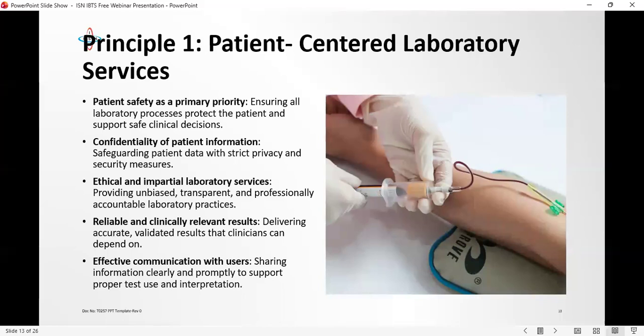what medication they are going to give to the patient, who gets what dose. Imagine a microbiology where you just give a result and you just say, yes, all the antibiotics are sensitive. You did not do proper quality control to find out what organism. You just said mixed growth. All the antibiotics are sensitive. The doctor will come back to you and say, I don't understand what you did. You need to tell me it's 1, 2, 3 organism, whether it is Staph aureus, whether it is E. coli, whether it is Pseudomonas, and the respective antibiotics that you have tested, the ones that are resistant, the ones that are sensitive. If you give them the antibiotics without giving them the name of the organism, they will look at your lab and say, it's as if these people don't know what they're doing.